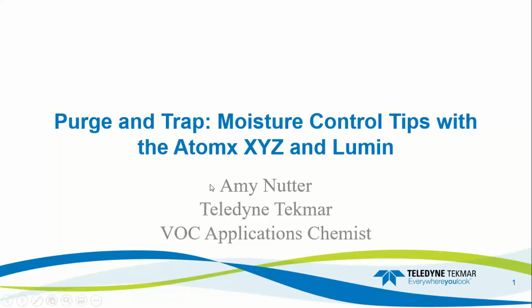Thank you, Shelley, for the introduction. I'm Amy Nutter, Applications Chemist here at Teledyne Tekmar, and today I will be discussing tips for better purge and trap moisture control. So let's get into it.